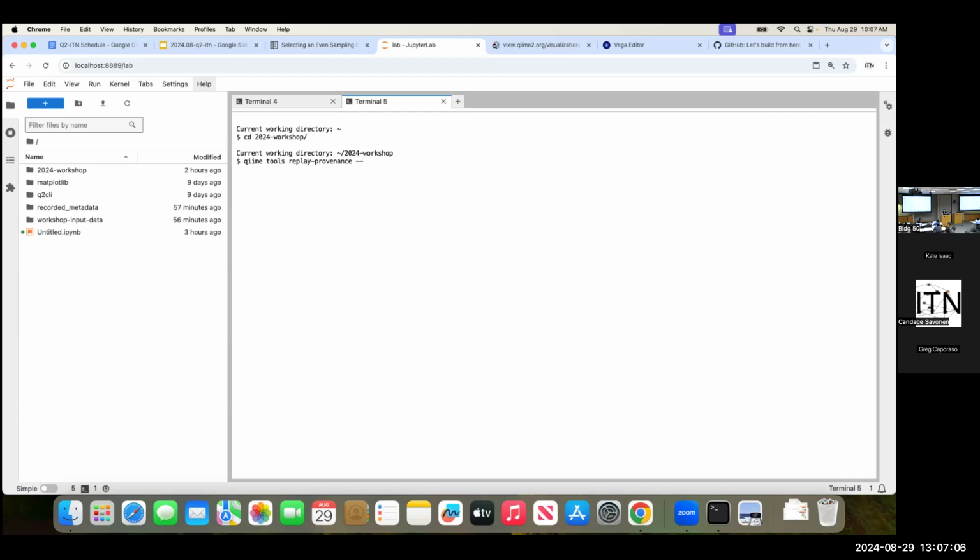All right, in FB, cool. And then because I am in the file that has all of the artifacts that we generated, I can just press dot, because just like we use dot dot to change directory to move back, I can use one dot to say right here, right where we are.